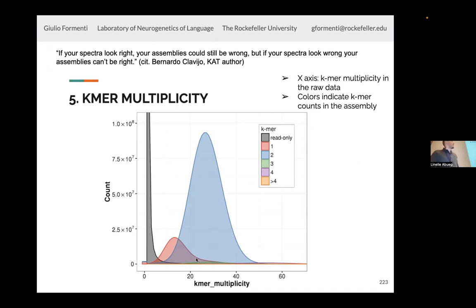So it's 3 times in the assembly because it's green. We colored it based on its counts in the genome, but in the reads there is not really support for it, because the number of times we have seen the same k-mers in the reads supports 2 copies in the assembly.